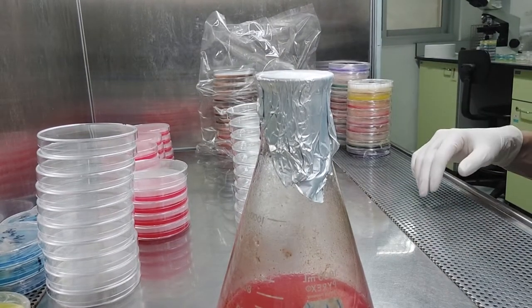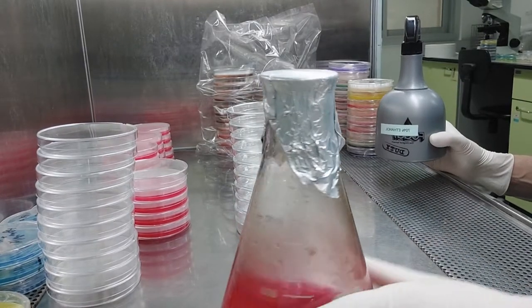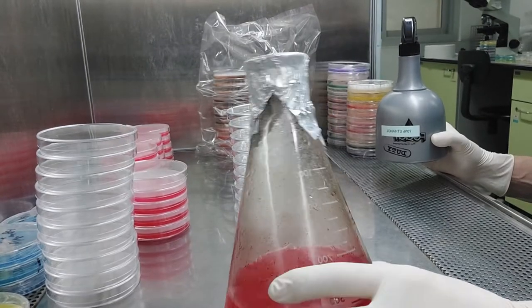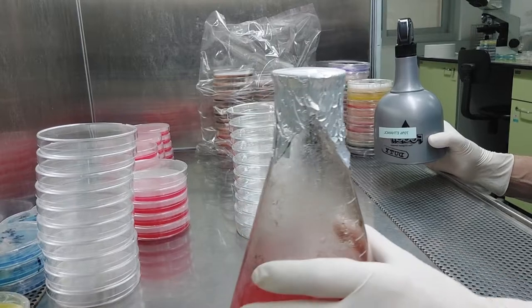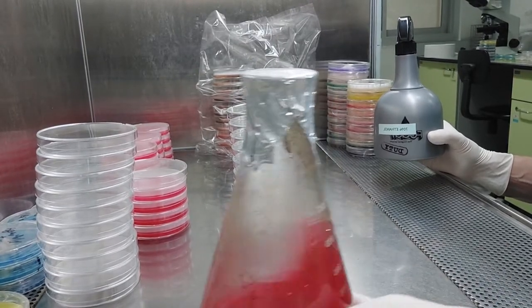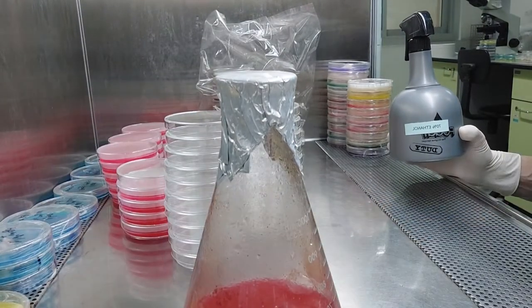I want to show you real quick how I do it. I know there's a million videos about this, but here's my approach. I got my standard — I think this was PDA today — 2% potato starch, 2% agar, and about 0.1% yeast, just baker's yeast. I'm going to pour about 20 plates, so I got my plates already out here.